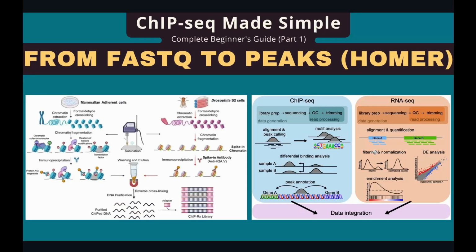In this video, I'm going to show you how to analyze ChIP-seq data. So what is ChIP-seq? ChIP-seq is a technique that allows us to study the interaction between proteins and DNA. This technique is crucial for understanding gene regulation, epigenetic mechanisms, and chromatin structures.